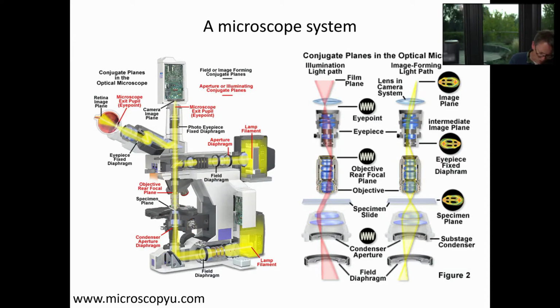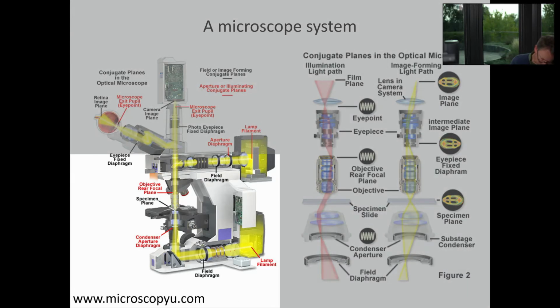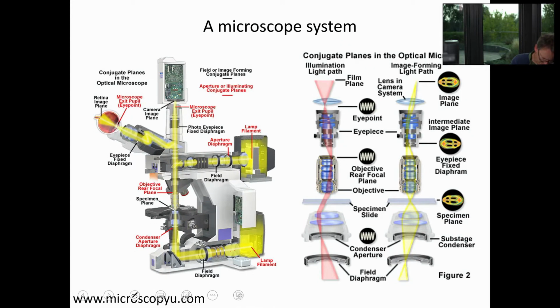This microscope can also be used in fluorescence. And in fluorescence, we excite and detect through the objective. So what you do is, let me just change the color if I can do this. I'm not sure I can. I don't know what's happened now. Let me just try it one more time. Yep. So if I take blue light for this, let's suppose I have light coming through.